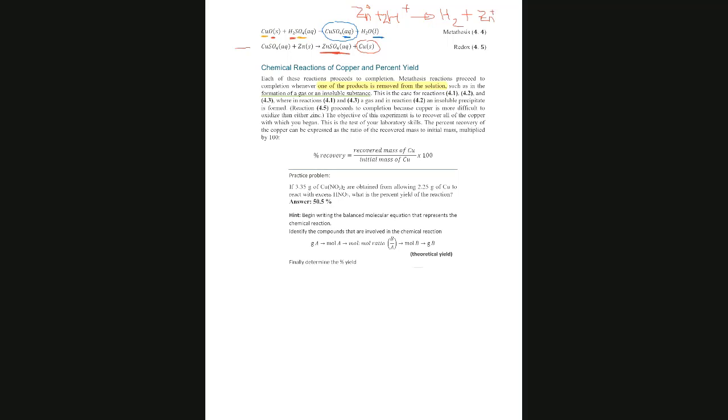This is a side reaction, but I'm writing this now because there are hydrogen bubbles that you have to observe.